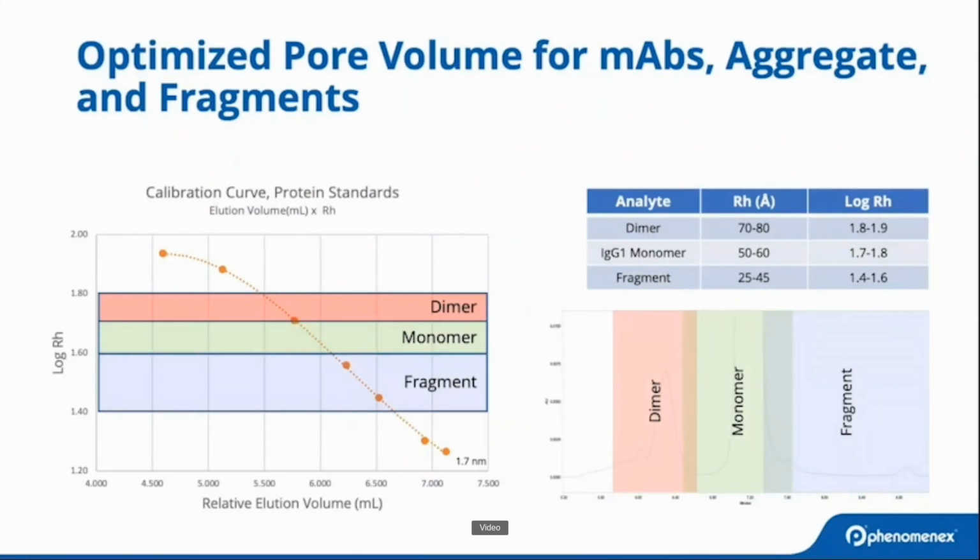So in summary, the pore volume has traditionally been prioritised, but at the expense of mechanical strength. Consequently, size exclusion method robustness has suffered, and as such, having a lower pore volume silica will enable a more robust and reliable separation for these particular modalities.